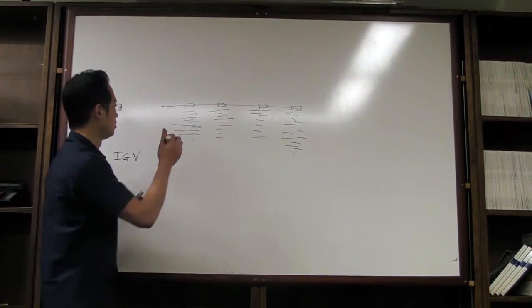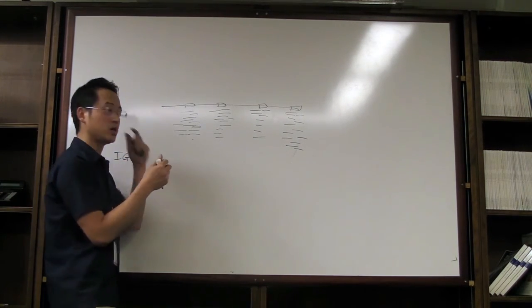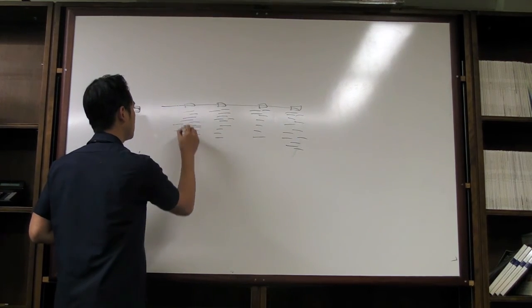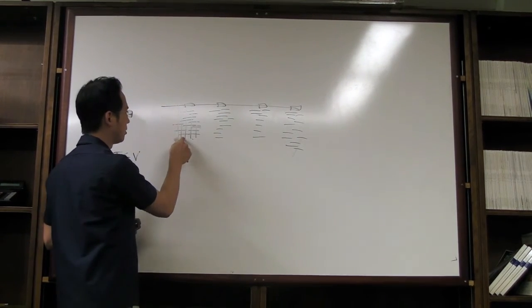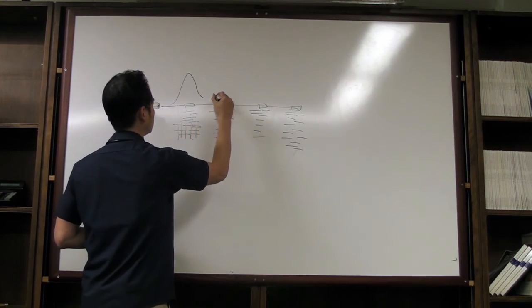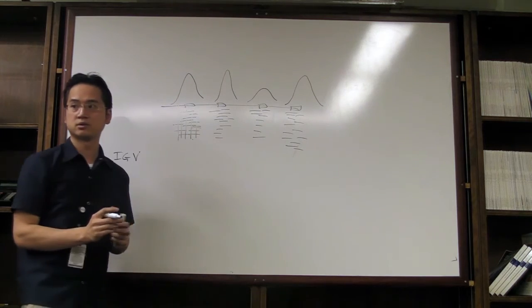But right now, if you do this, you also want to layer on top of this some additional information. So what you can do is just draw lines straight through here, and basically count up how many reads cover that one base. So this will give you a coverage plot, like that. So that's coverage.